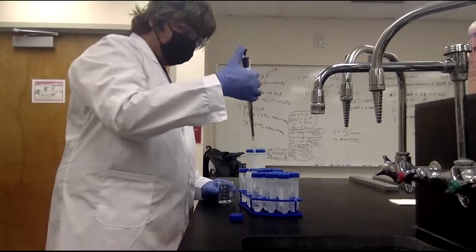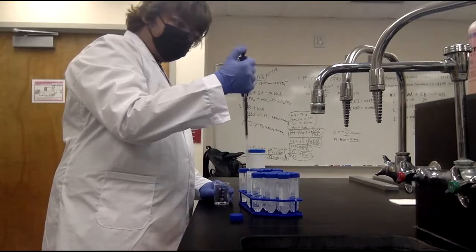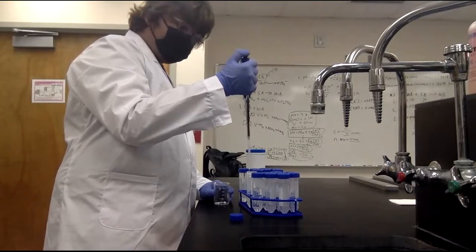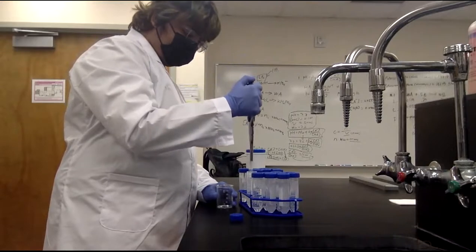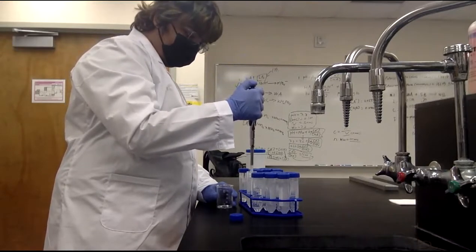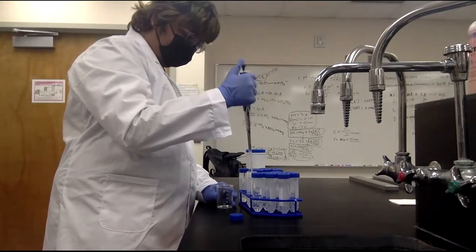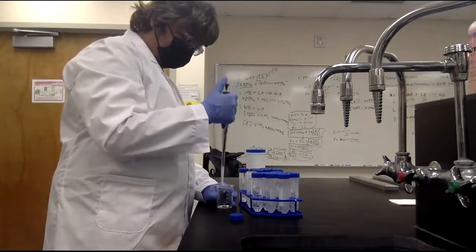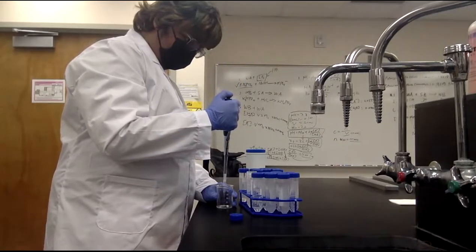So we just put it in and just plunge it. You push it first. You feel the stop. Okay. Yes. Then release it slowly. Well, not that slow, but yeah. Then push it. Do you feel the first stop? Then push further.